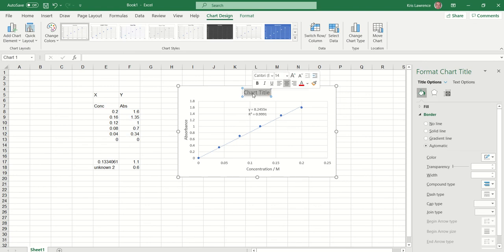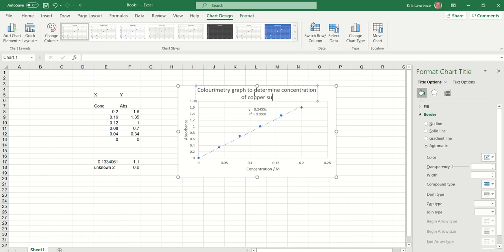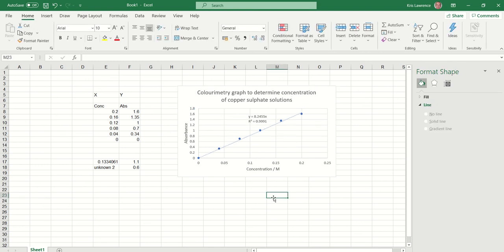Then add a chart title — just give a title for your graph, something roughly describing what you're actually doing with it.